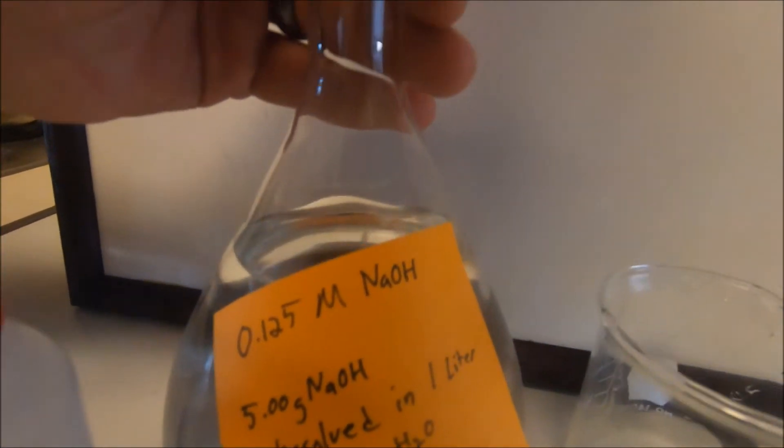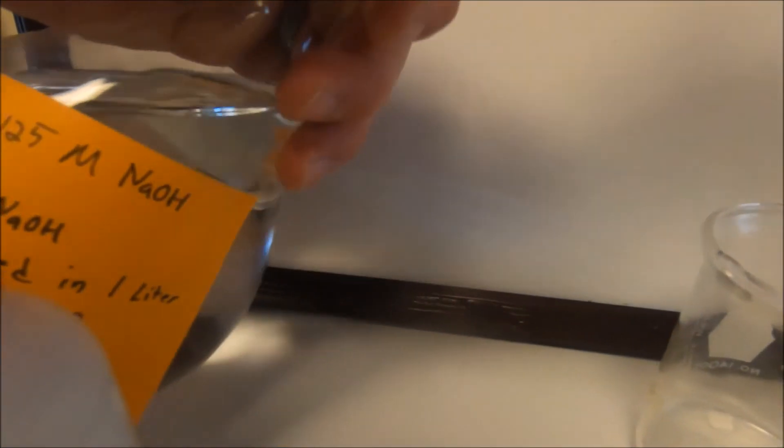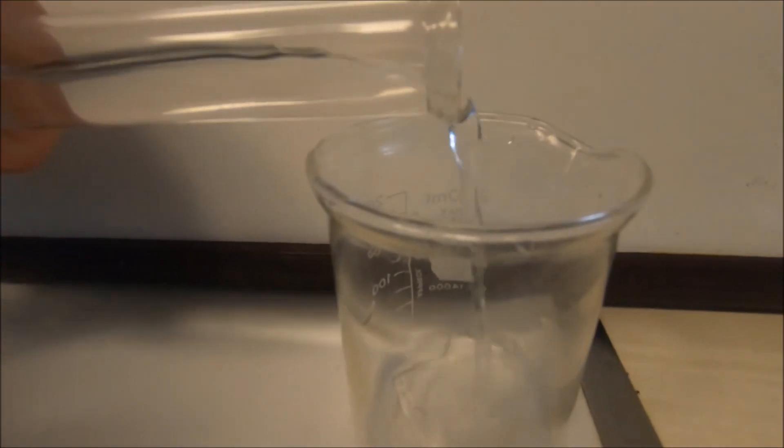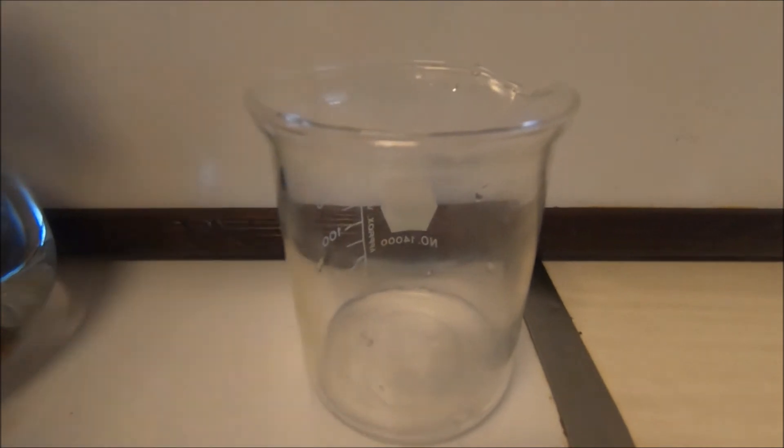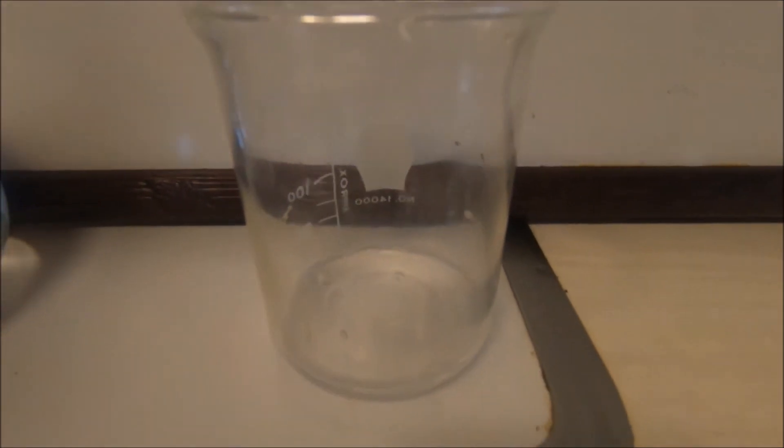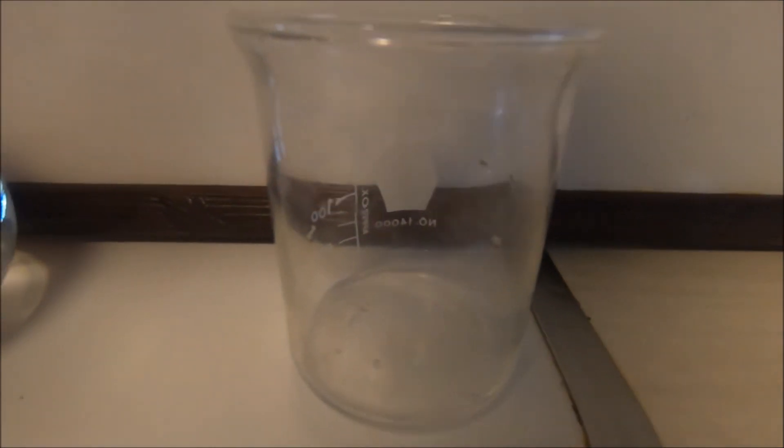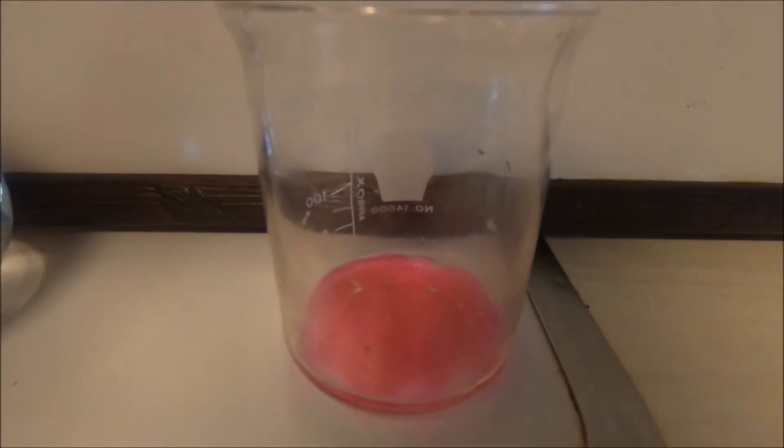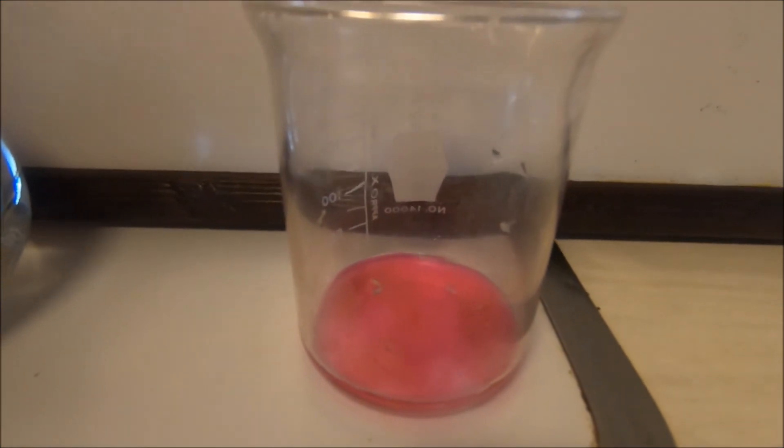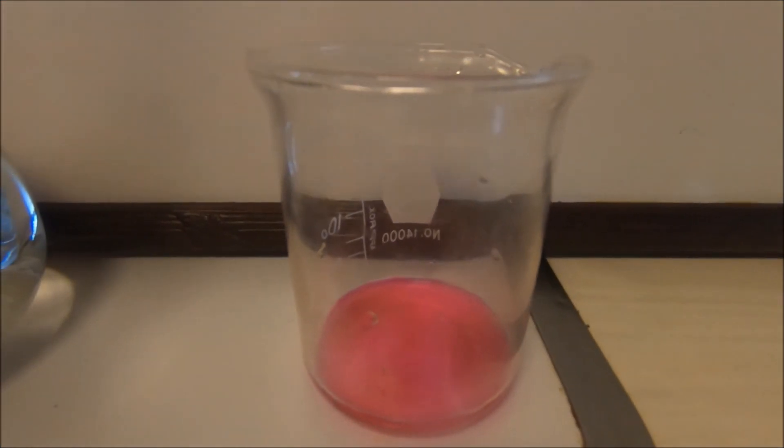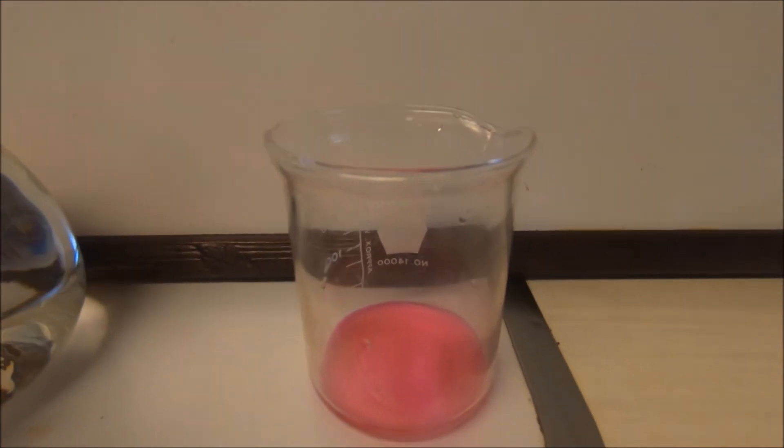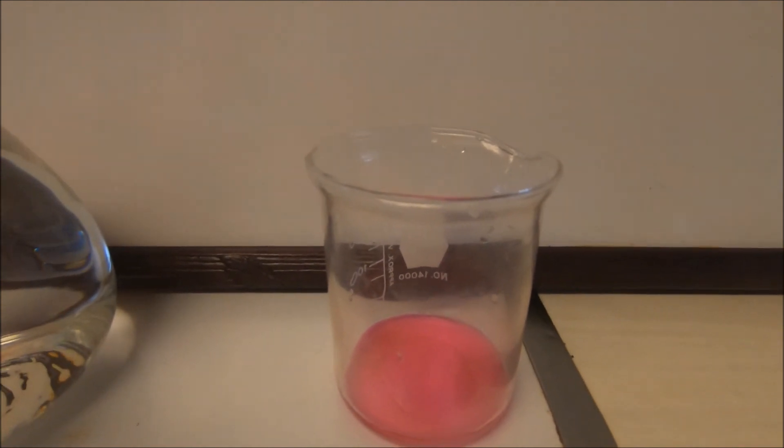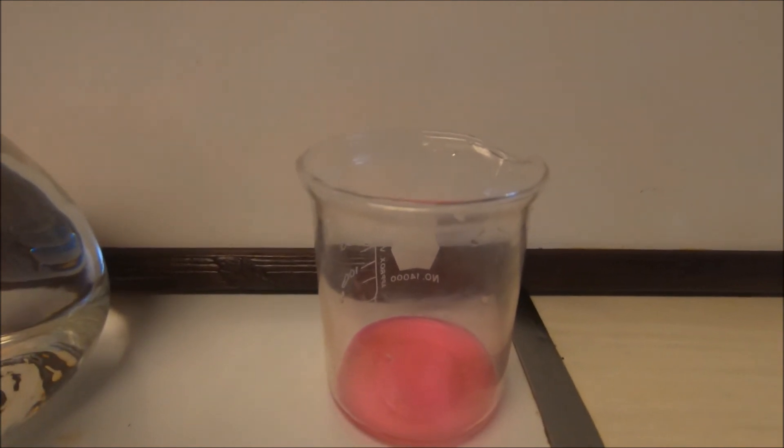If we were to take it and add it to a solution of sodium hydroxide, phenolphthalein will react with that sodium hydroxide and produce a color change. So the idea behind that is that in an environment that's basic the phenolphthalein will turn to that nice kind of genta pink looking color that's going to show us that we actually have a base.